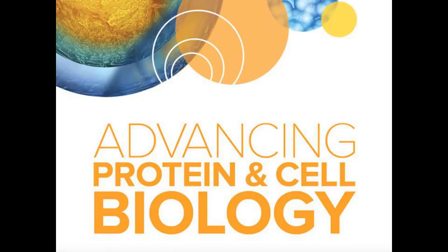Most recently, her focus has been on exploring the use of 3D models such as spheroids or cells cultured in Matrigel for studying cell viability, morphological changes, mitochondrial damage, and autophagy. These studies include the use of automated confocal microscopy for live cell time-lapse experiments, as well as screening assays in 384 well microplates. She has a BS in Animal Science and an MS in Biology.